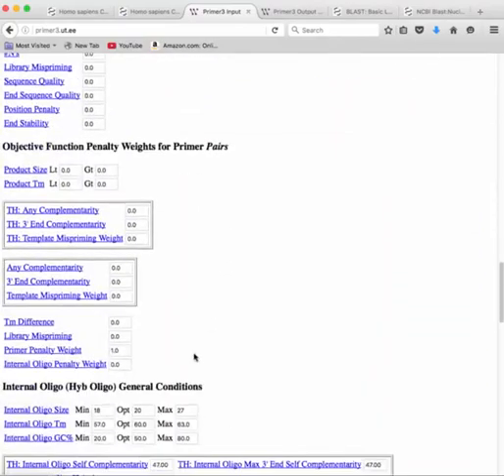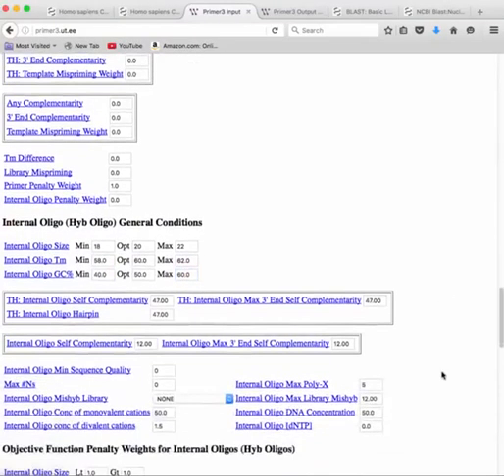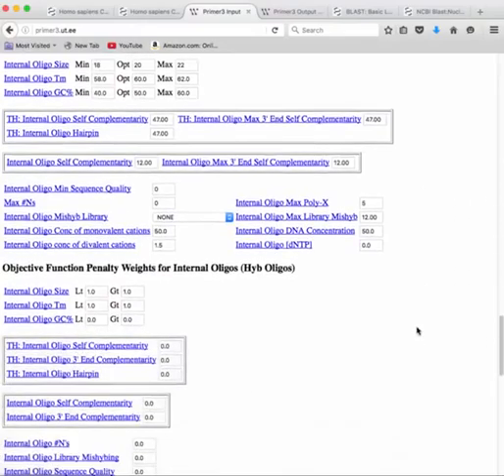So then I go further down and I will see the same information for my oligo. I say, because I'm going to order my probes, which would be for MGB, non-fluorescent quencher, for me, 20 bases is good enough. And similarly, 58 to 62 of TM, and then 40 to 60 GC percentage I select, and that is all. I don't do much. And most of the conditions that are required for the primers and probes are already taken care of by the software.